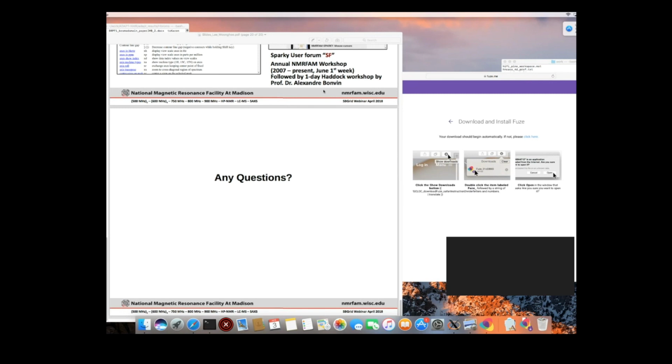And also, by using the Pine-Sparky 2 plugin, you can turn on the use pre-assignment toggle, so you can achieve gradual improvement in your assignment by employing iterative auto-assign. So you just run iPine initially and get some assignment back, and then refine a few and get some more assignment by hand, and then you can just rerun iPine again.